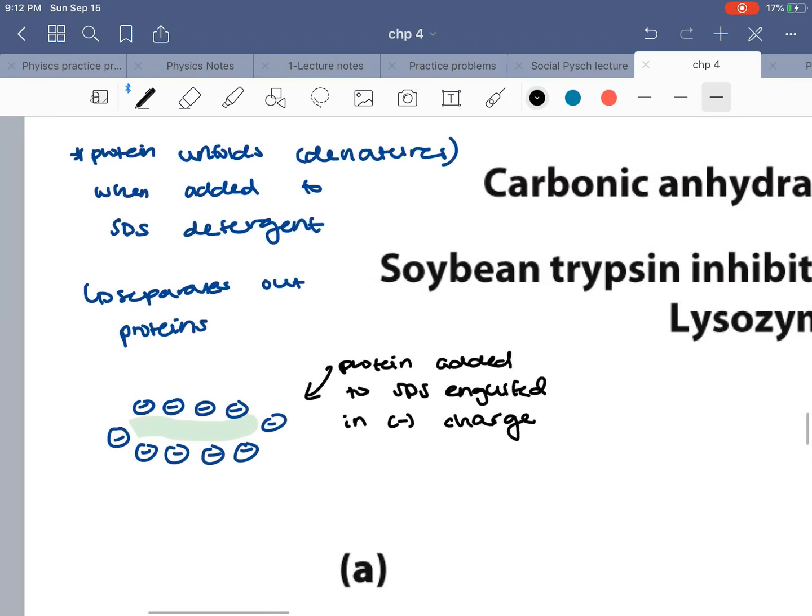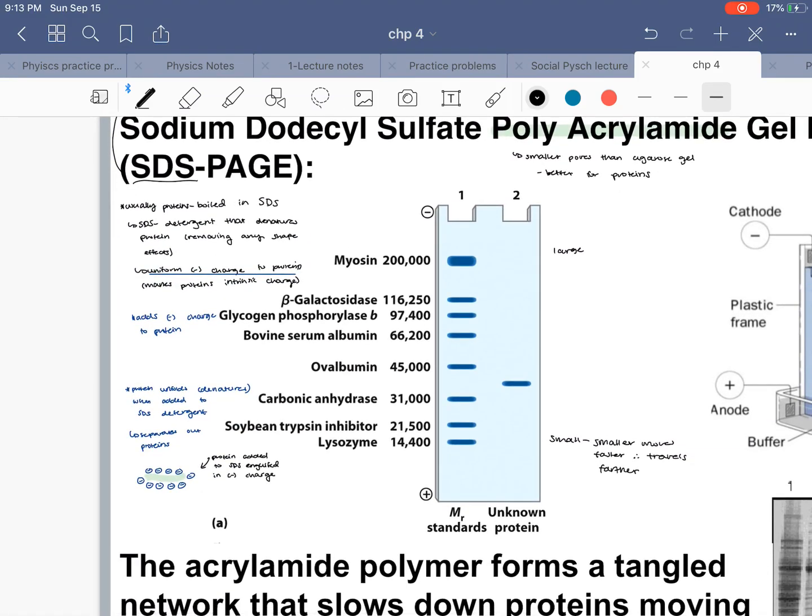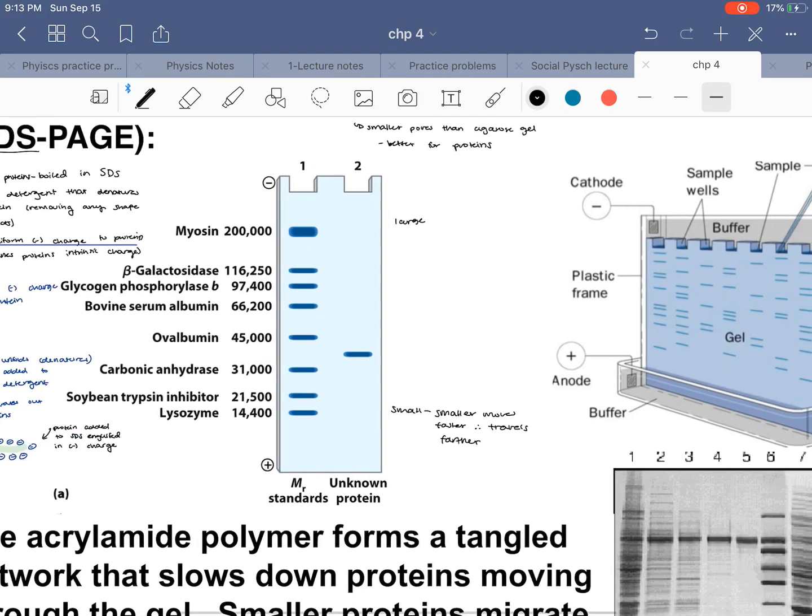As you can see, this is kind of what it would look like. We have a little protein, and our negative charges are just engulfed around it. Okay, so that's the setup that we're going to be using for the SDS. And then after that, it's just kind of like a normal gel electrophoresis.